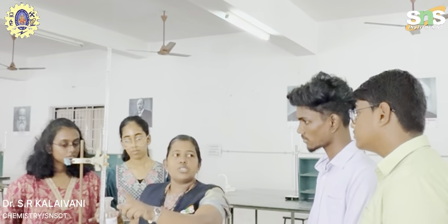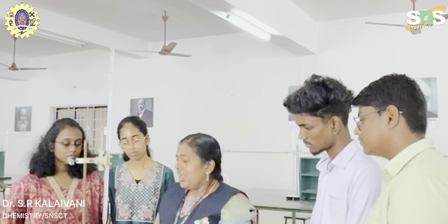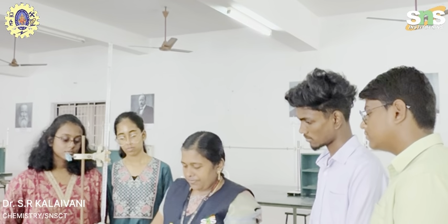This is the burette solution for all the 3 titrations. In the first titration, EDTA is filled in the burette. Standard hard water is pipetted out into a conical flask.